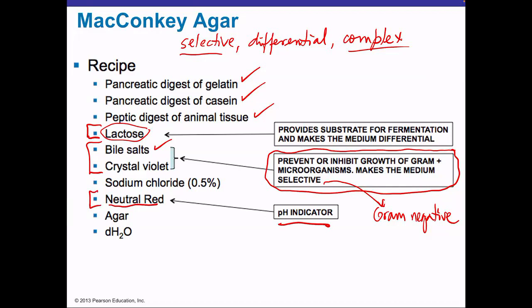In this case, lac-positive bacteria, that means those gram-negative bacteria that can ferment the lactose, by utilizing the lactose available in the medium, like for example Escherichia coli or Klebsiella aerogenes, will produce acid, which lowers the pH of the agar, and this results in the cells and the colonies getting a pink color.